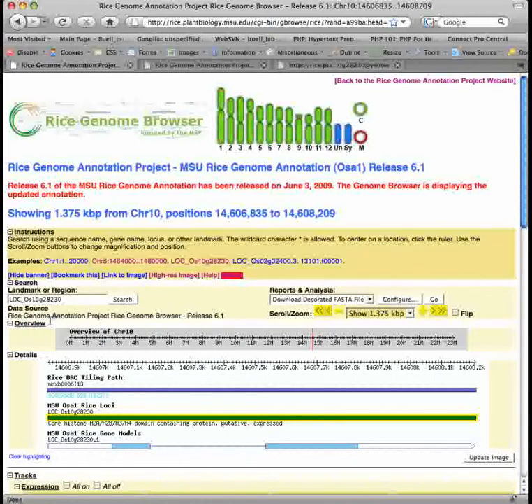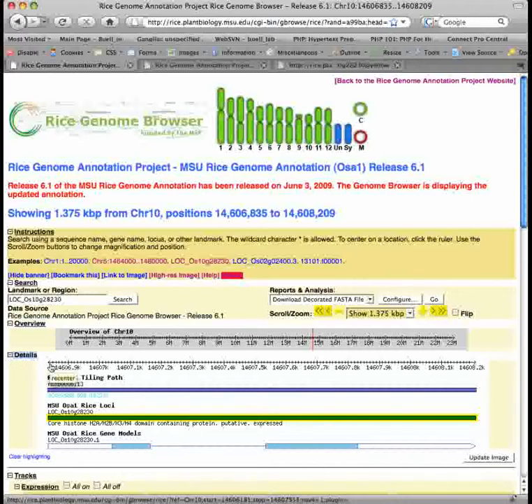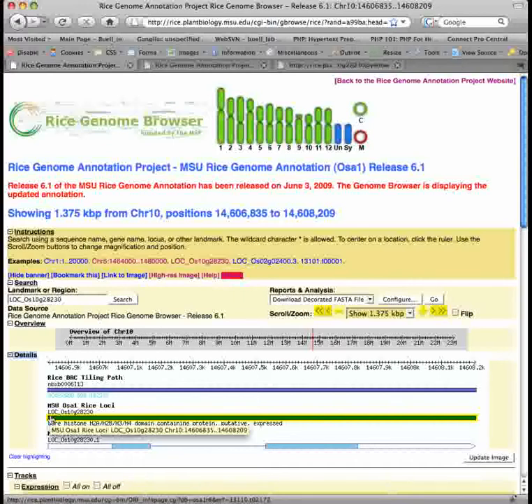The overview panel provides an overview of your selection. In this example, we are viewing a position at 14.6 megabases on chromosome 10. The details panel provides more detail on the selection. The default view shows a magnified region of chromosome 10, the BAC tiling path in this region, and the locus and gene models.